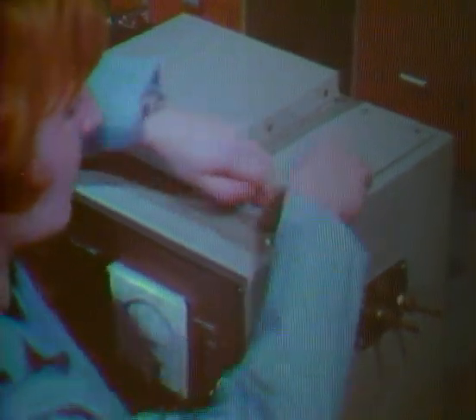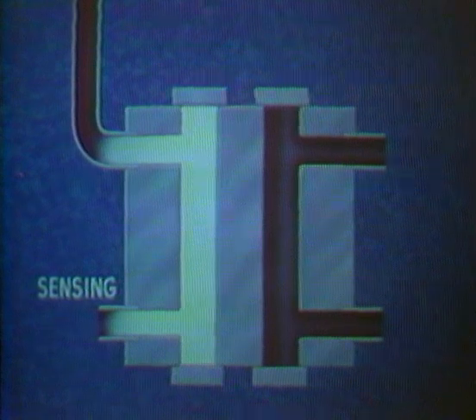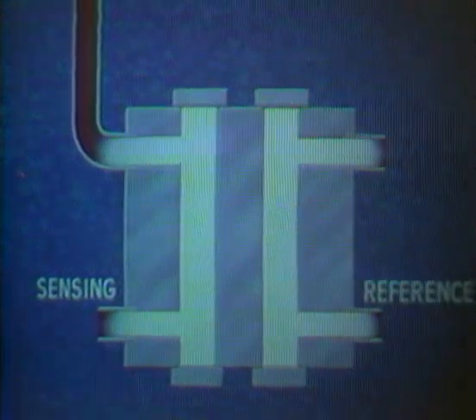Detectors measure the concentrations of sample components eluted from the column. The most generally used type does this by sensing changes in the thermal conductivity of the effluent from the column. In such a thermal conductivity detector, the stainless steel block, which is held at constant temperature, has 2 separate gas passages, one the sensing side, the other the reference side.